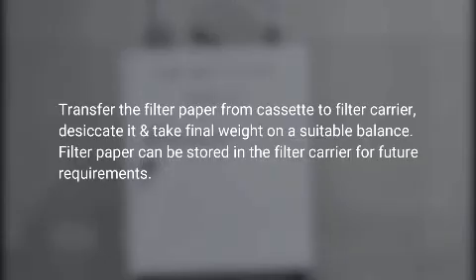Transfer the filter paper from cassette to filter carrier, desiccate, and take final weight on a suitable balance. Filter paper can be stored in the filter carrier for future requirements.